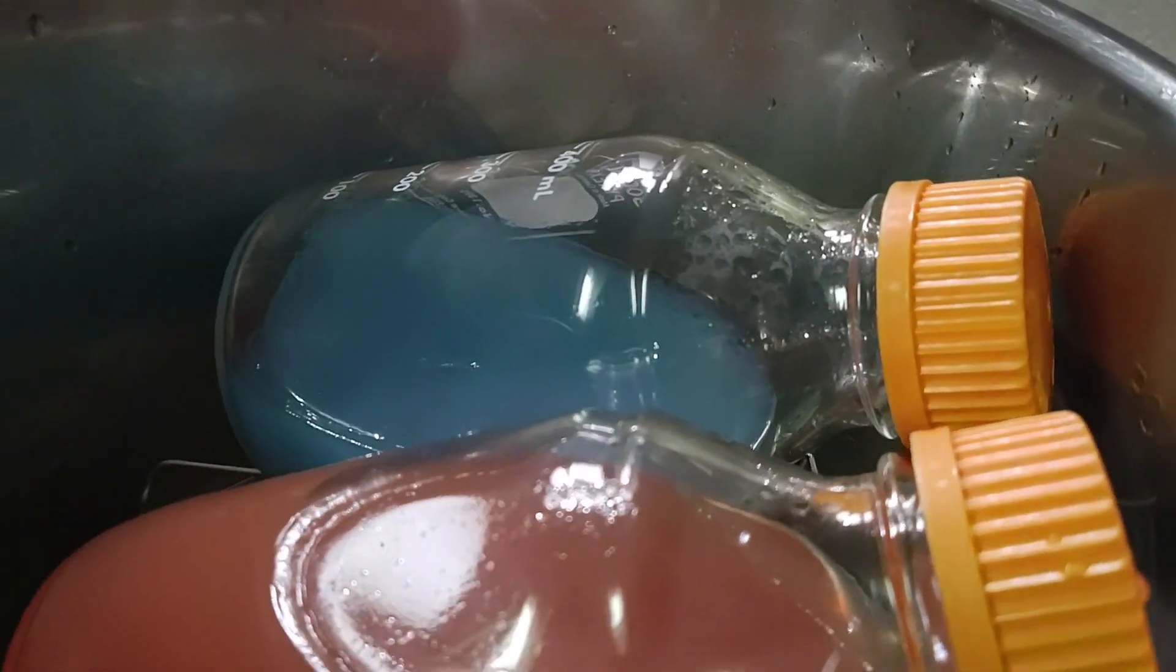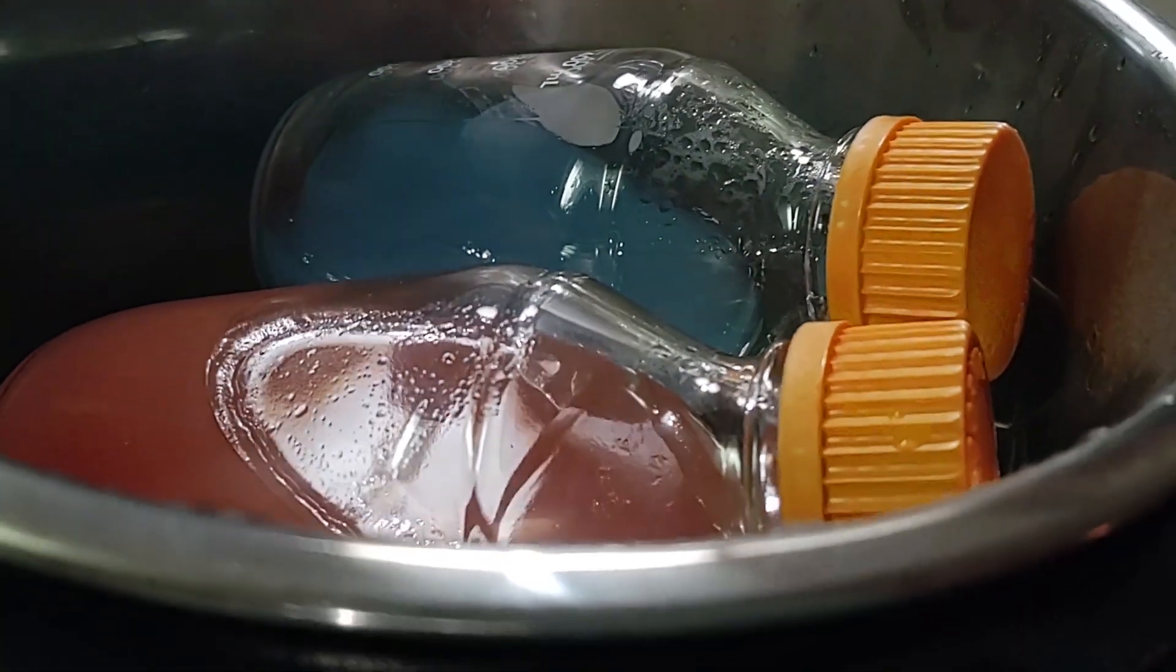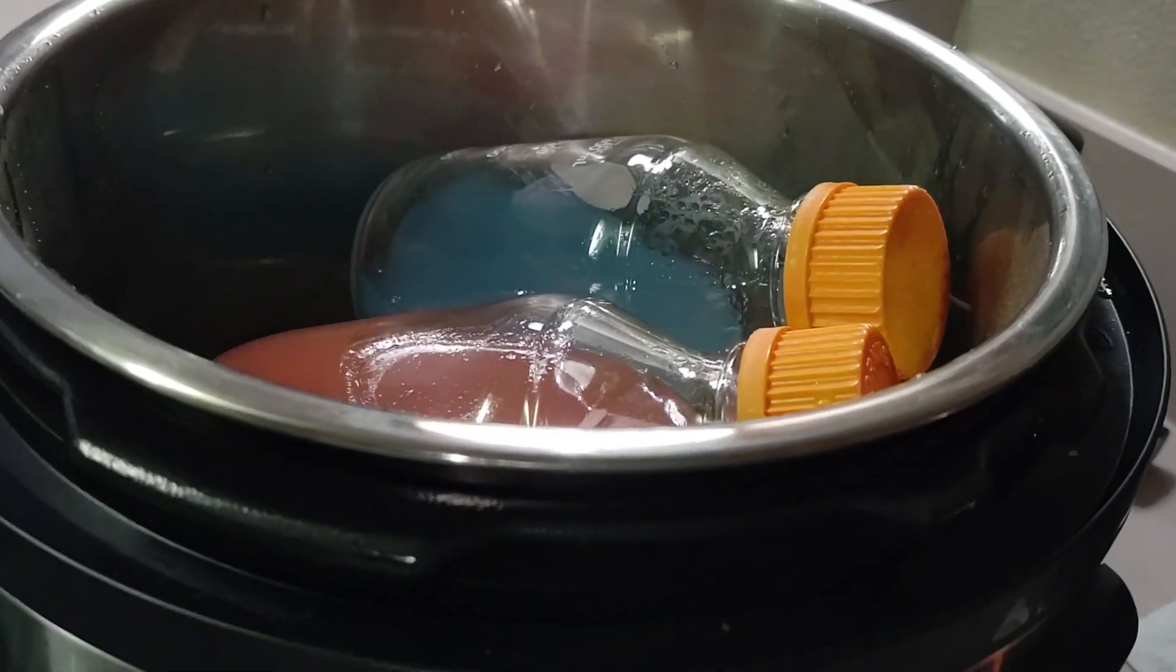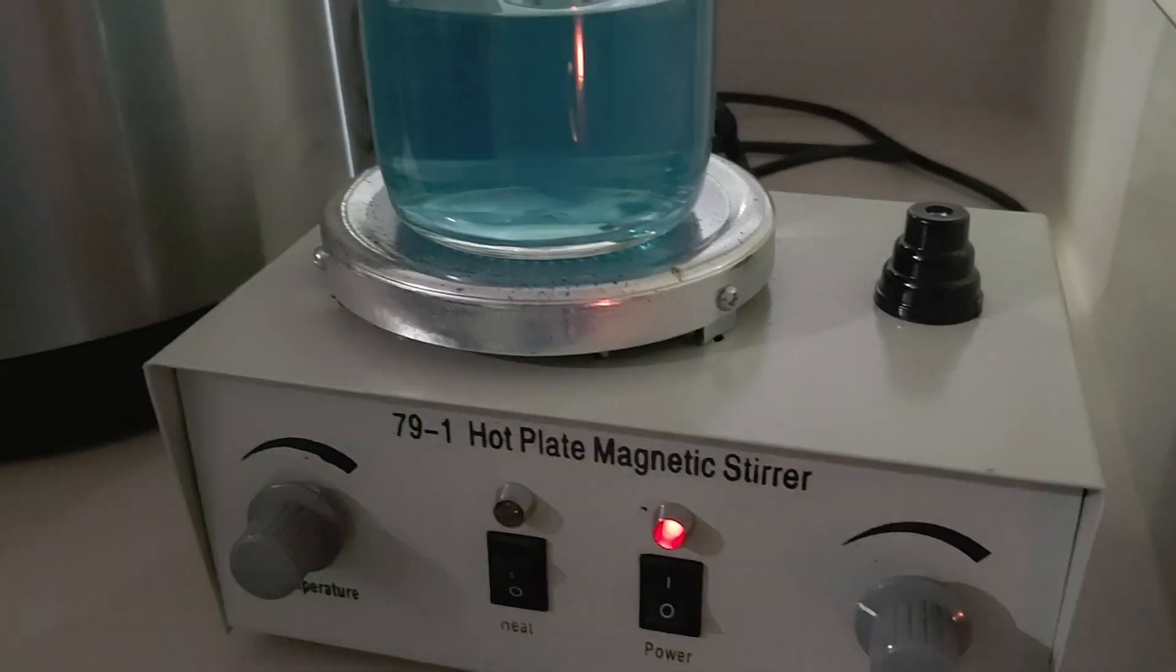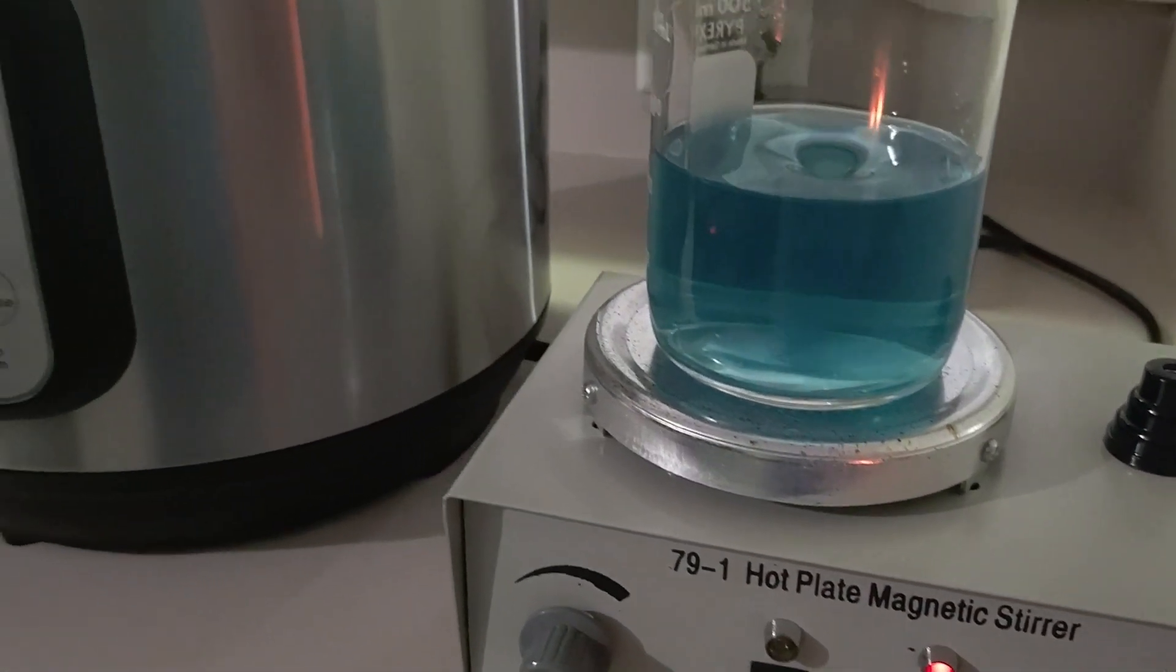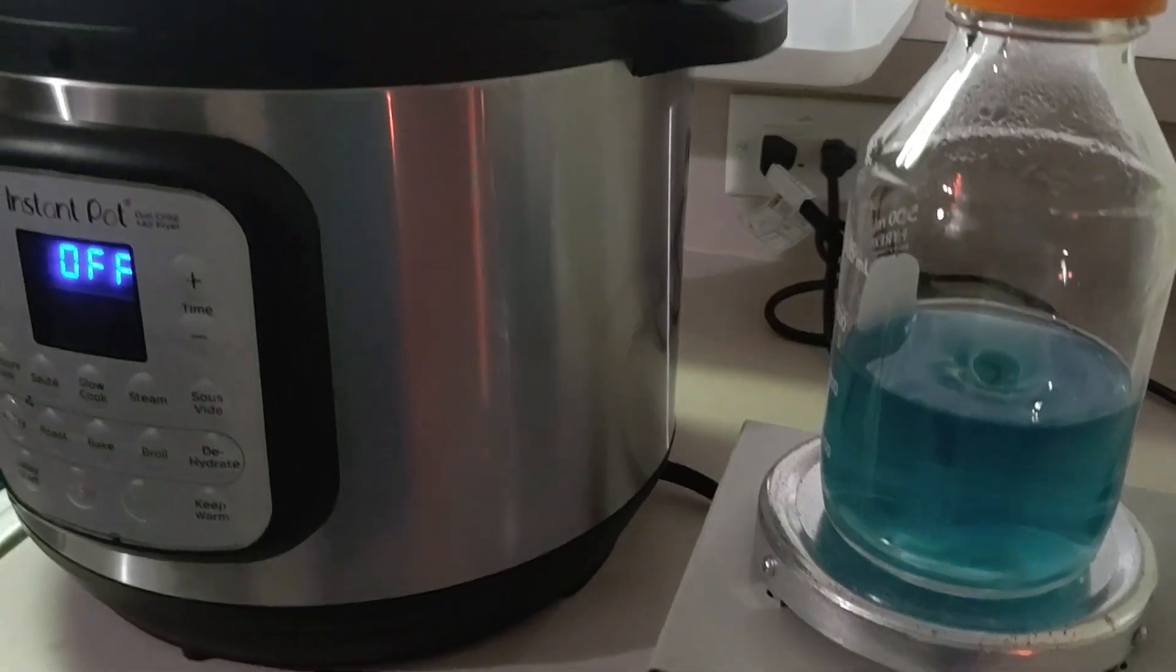You will want to pressure cook for 20 minutes at 15 psi then allow the bottles to cool between 140 and 120 degrees before pouring your dishes.